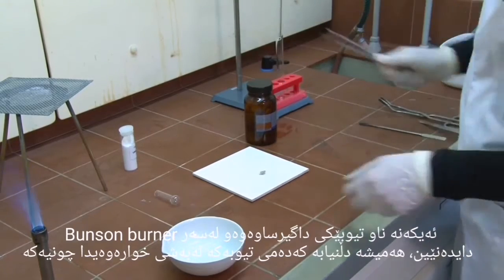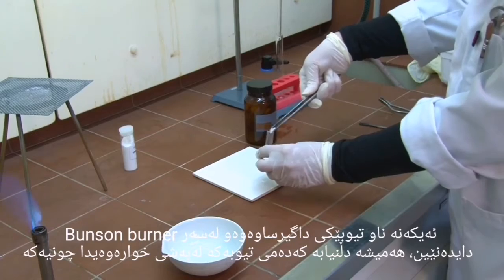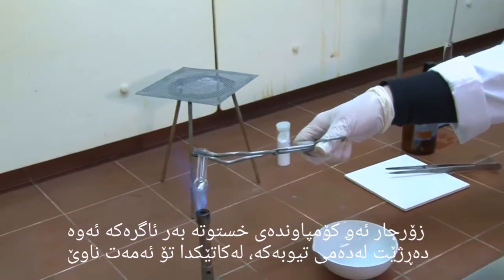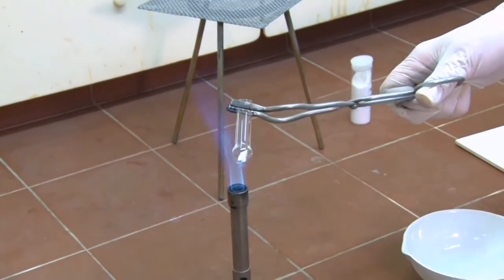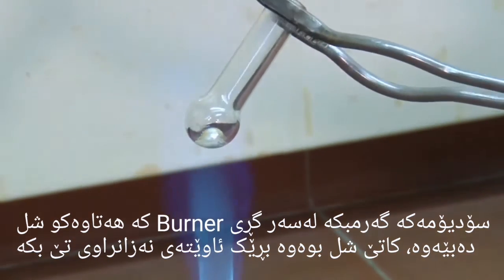Be really careful while you're holding the ignition tube over the Bunsen burner. Always make sure that the mouth of the tube's facing the back of the fume hood. Quite often your compound will catch on fire or spit out of the mouth of the tube. You don't want to get that in your face. Heat the sodium over a Bunsen flame until it melts.